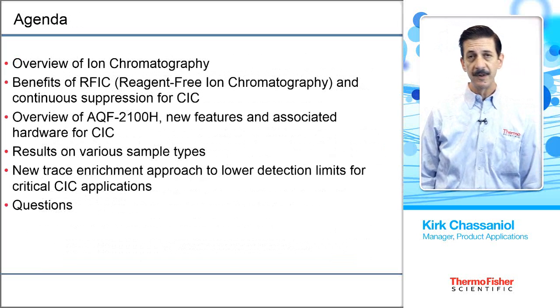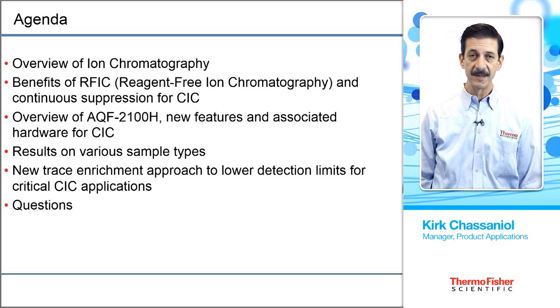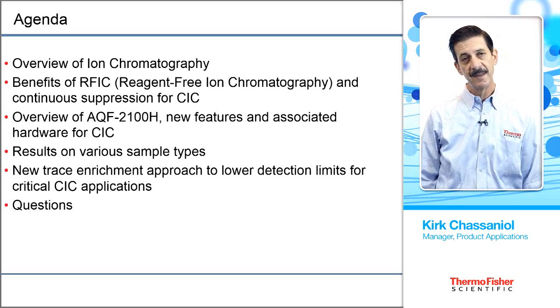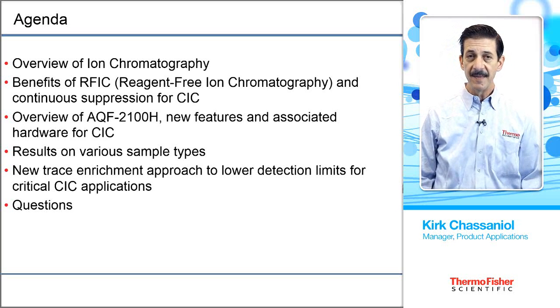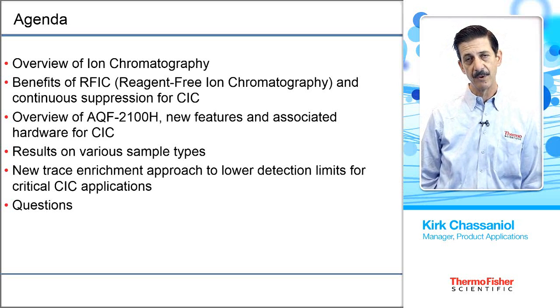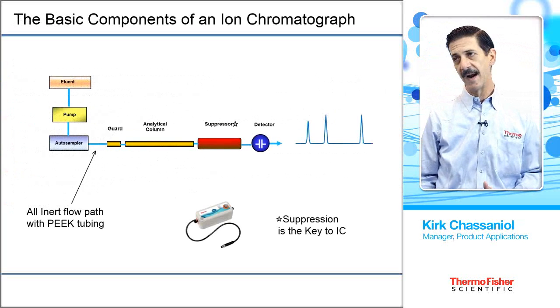So today we're going to give you an overview of ion chromatography and some of the benefits of reagent-free ion chromatography and continuous suppression that we use with the combustion IC system. And then I'll hand it over to my colleague, Mark Manahan, to go through an overview of the AQF, the hardware, go through some of the various sample types. And then we're going to tell you about a new technique for enrichment of the sample for lower detection limits for critical applications.